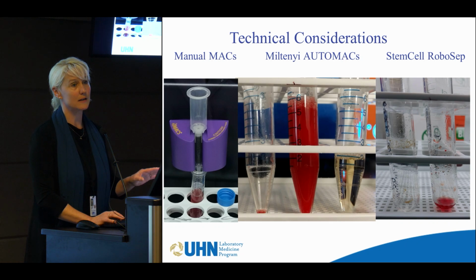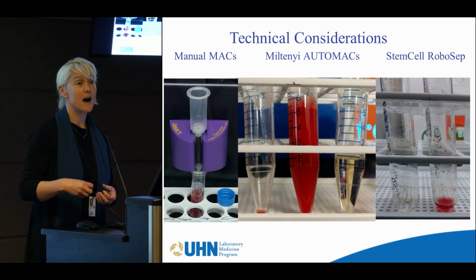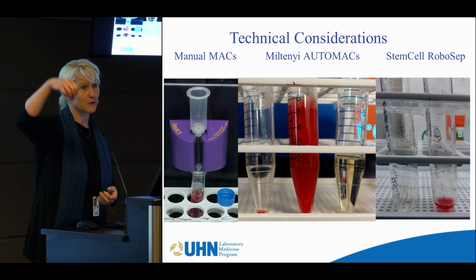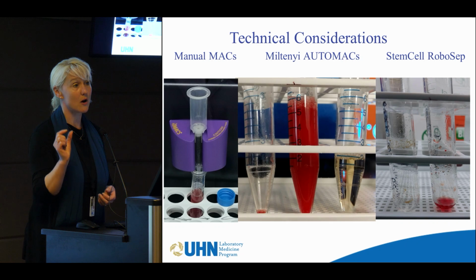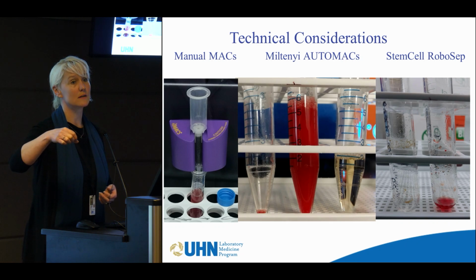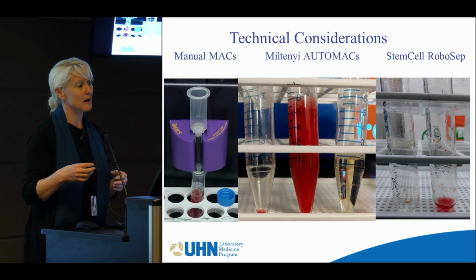Miltenyi, we recalibrated the aspiration arm, however it was unsuccessful, but with StemCell, they made many adjustments to the system, allowing the aspiration arm just to sit on top of the tube to allow everything to drop back. They pre-wet all the pipette tips before going into a solution to prevent any cells from adhering inside the pipette tip.